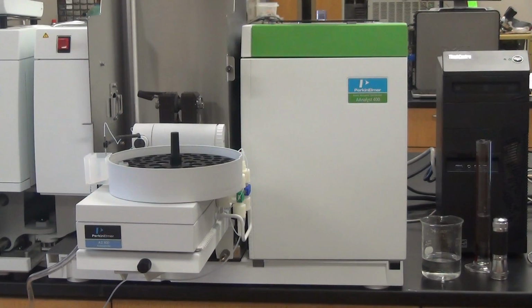And I'm going to show you how you can tell if your wavelengths are right. First of all, you go to line lamps.